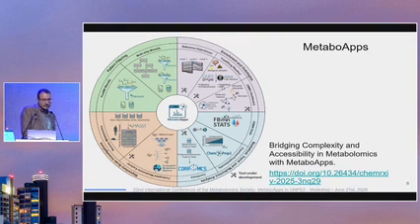We have the preprint already of those tools, but I want to highlight that they are continually being improved, and the repositories for them are continuously being enlarged. So if you check them from time to time, you're always going to see more and more information on that, and the data sets that are uploaded to them are going to be larger and larger from time to time.